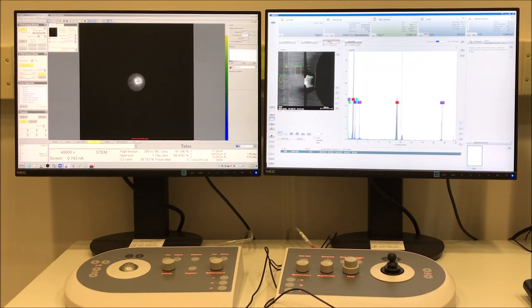So you can see as each spectrum is done acquiring, it will populate in that list underneath the spectrum window. The system will attempt some sort of auto ID, which we discussed in the general operation playthrough. It's essentially the same thing. And there's the third spot done. And there should be one more, which is that polygon area I drew over the bright region, which again is the gate. You can, of course, manually stop it before then if you select stop. That used to be the acquire button, but I'm just going to let this complete here.